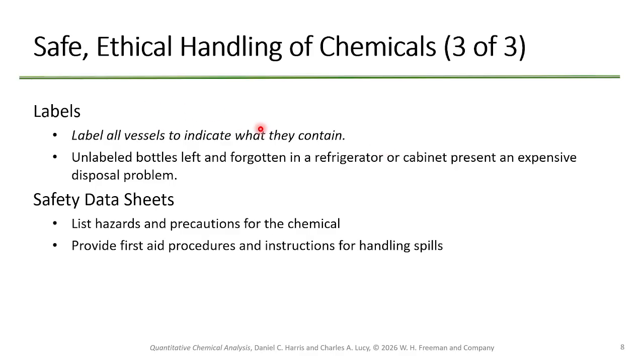Okay, labeling is going to be something we're constantly going to be fighting over, and we're going to have issues with it. You guys are going to make batches of chemicals, and you're going to need those to do dilutions and stuff. And then what should you always do every single time? They need to be labeled. Okay? If they're not labeled, what's going to happen to them? They're going to get dumped into waste. Okay? And they might have to be treated as very dangerous chemicals because I won't know what it is.